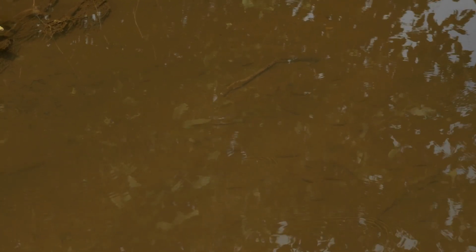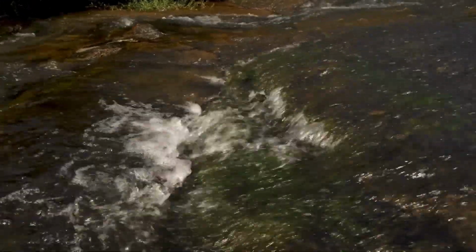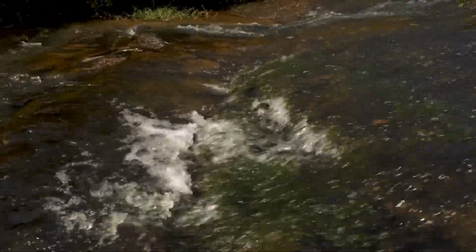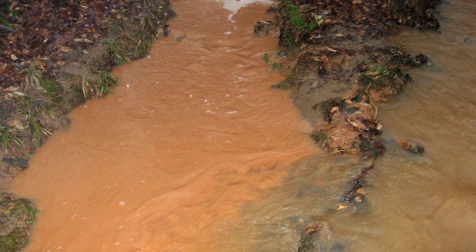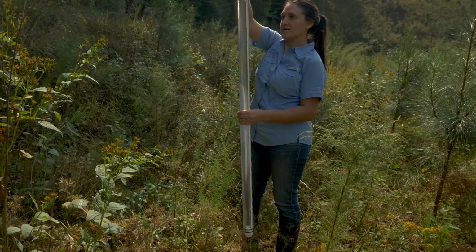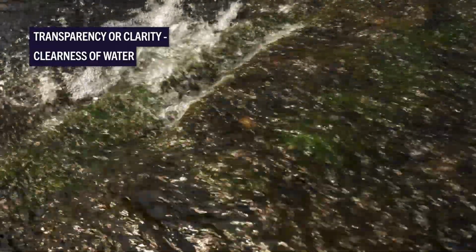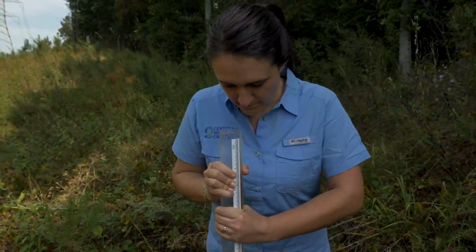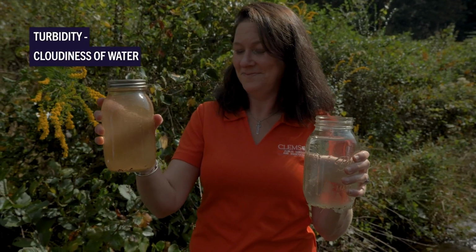Assigning a numeric result to sediment load allows citizen scientists to record imbalances in our rivers, enabling resource managers to determine if further action needs to be taken to protect a waterway and ecosystem. We're using the transparency tube to record this measure. Transparency is the clearness of water, interchangeably known as clarity. Color, algae, phytoplankton, and suspended sediments can all alter this result. From the transparency tube, we can next approximate turbidity, which is the measure of the cloudiness of water.